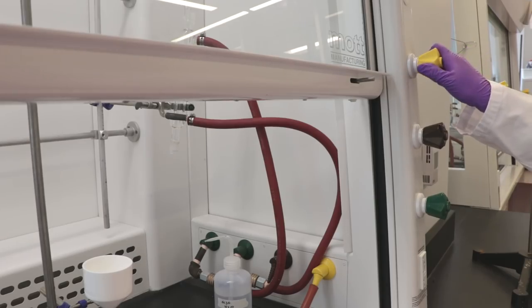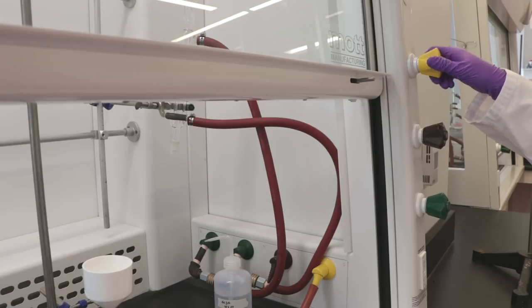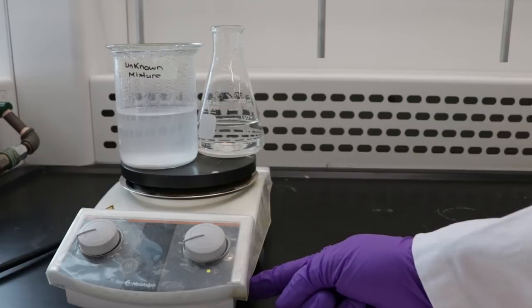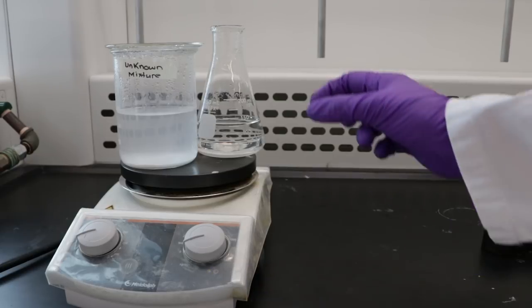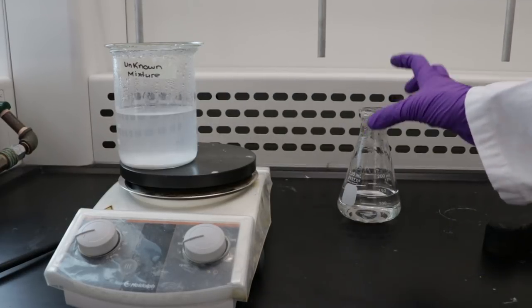Turn the yellow knob all the way to the left to start vacuum suction. Turn off the hot plate. Take the solutions off to cool.